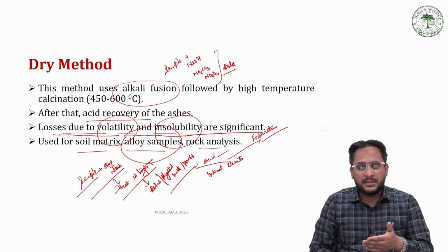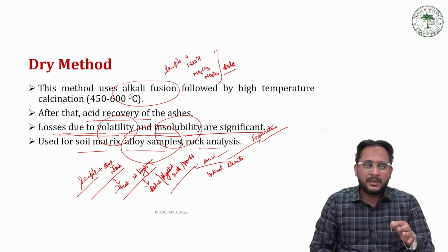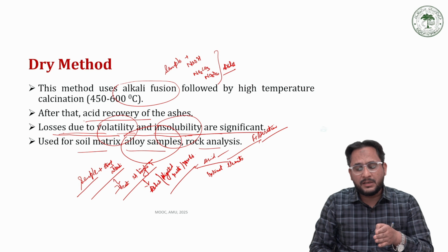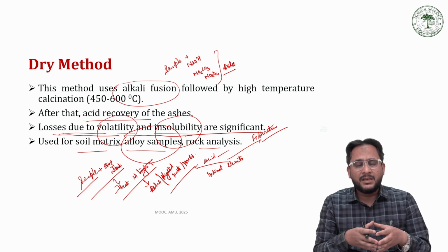When we extract with the help of acid, the target analyte will still be at a lower concentration in the acid.